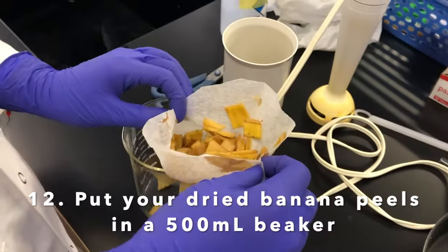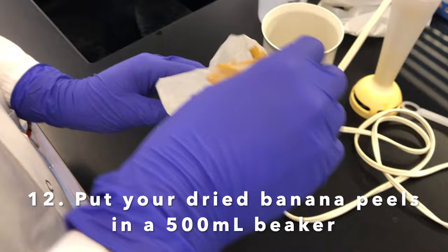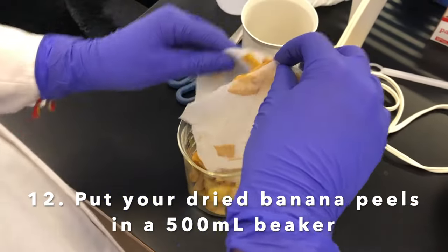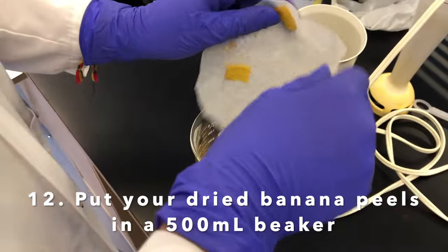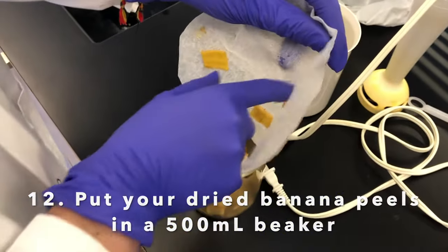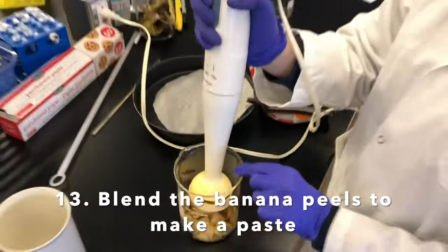We are going to take the parchment paper with the dried banana peels and put them inside a 500 milliliter beaker to form the paste. Now we're going to blend the banana peels to make a paste.